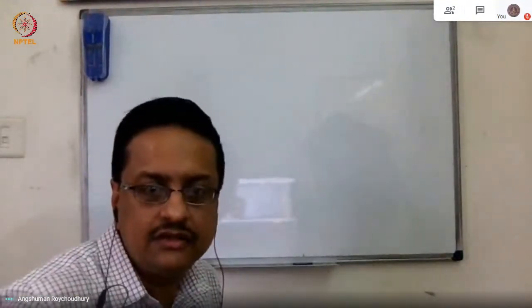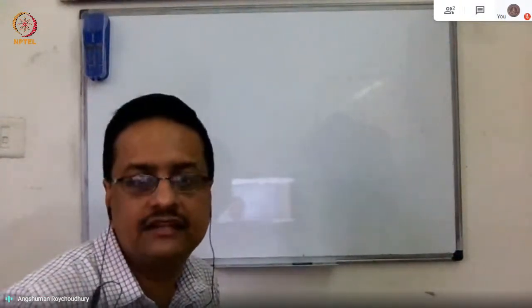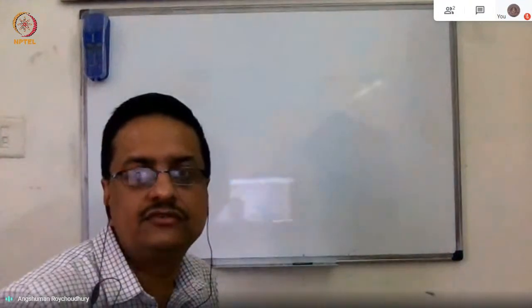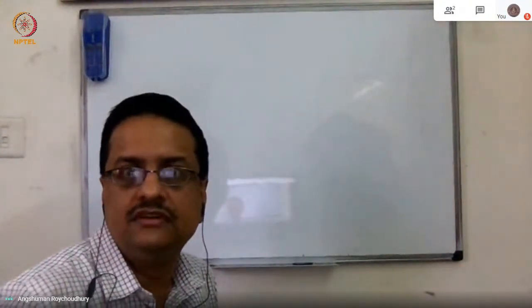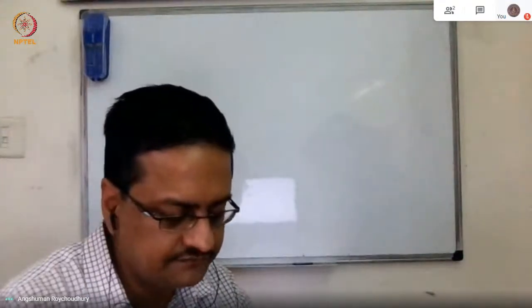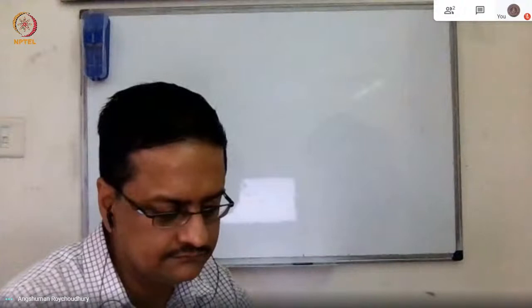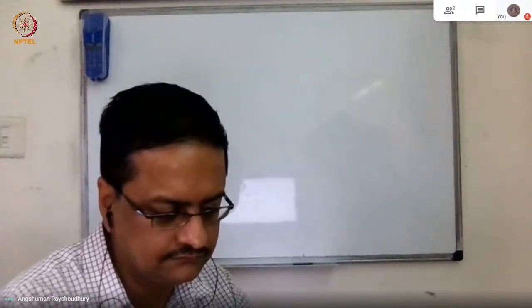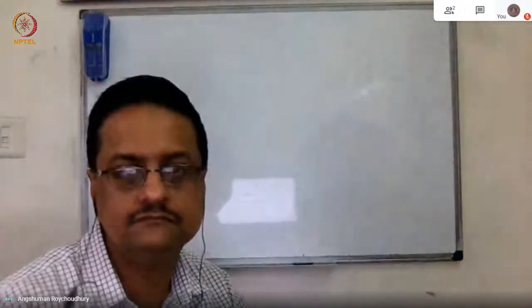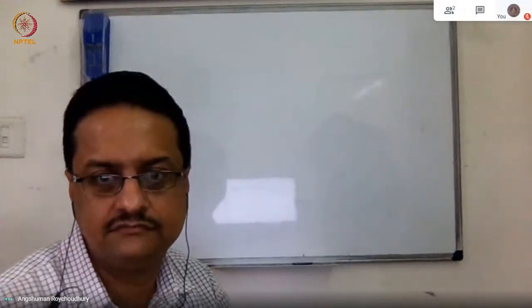Let me try to look at, I should be able to share a screen here. So I should be able to show you how the P212121 space group looks like. Just give me a second.